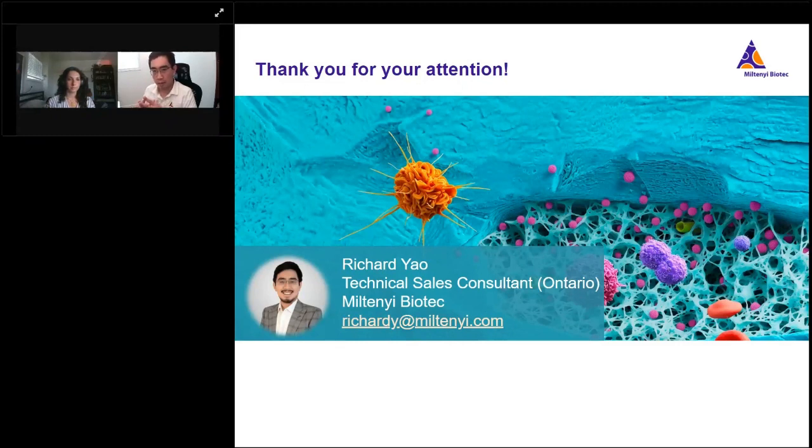What we mean by a messy sample is that sometimes when people are doing a liquid biopsy banking system, they collect the PBMCs, and at the end of the day, they freeze them, and then they store them in liquid nitrogen. And when they need to have a study cohort to do the study, they thaw them out, and then they do the stem cell extraction, for example, from the PBMC sample.